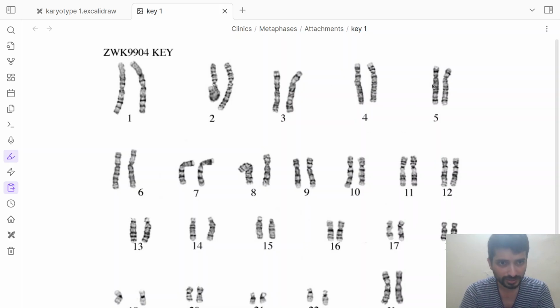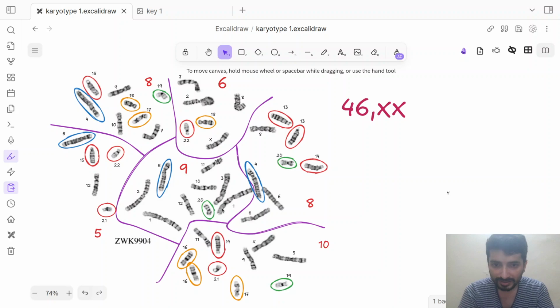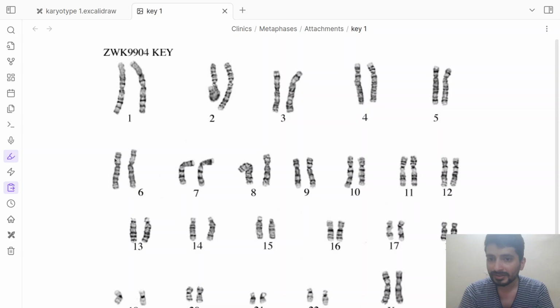for chromosome 4. As far as chromosome 5 is concerned, there are multiple dark bands, a little bit more distal to the centromere, and it would give the appearance of a box on a shorter chromosome 5, and this is actually called the box band. And remember that we had chromosome 6 quite close to each other, and they are given away by this large light region on the P arm.